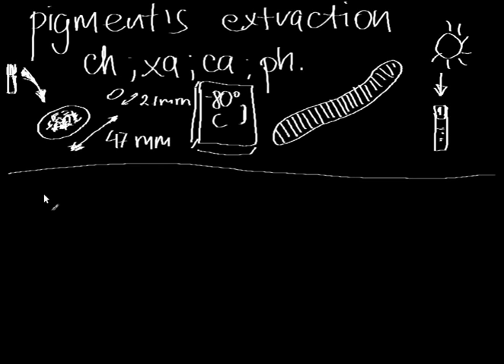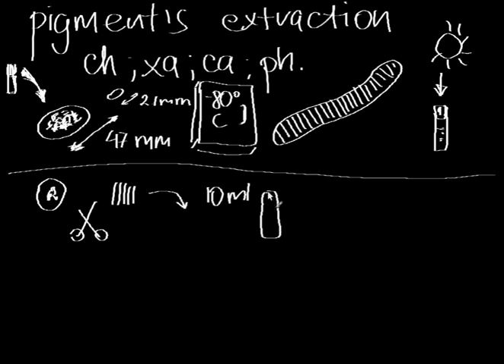We grab the filters with the biomass and cut them with scissors into small pieces. Then we put them into a 10-milliliter conical test tube.